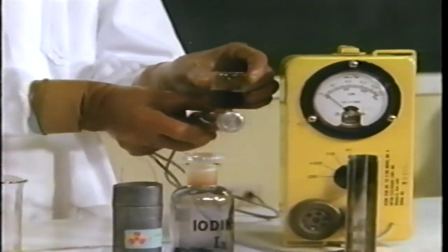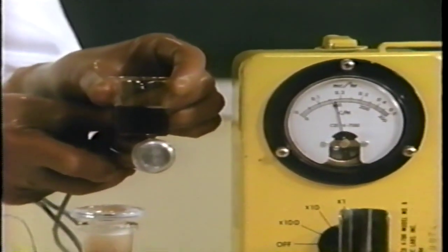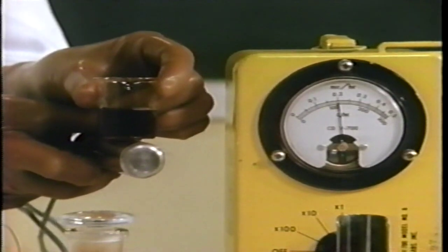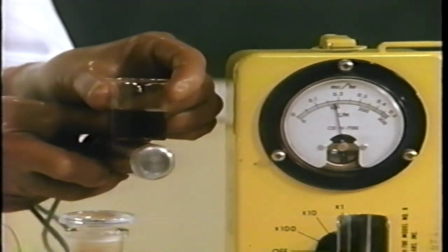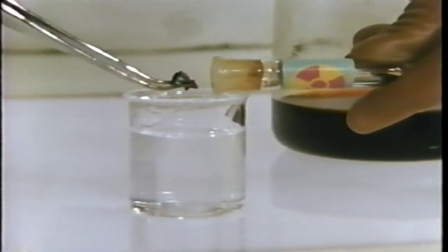Here is the same measurement an hour later. Now the meter shows that much more radioactive iodine is in the solution. The radioactive solid continues to dissolve. Yet, while all this was happening, the color of the solution didn't change. An exactly equal amount of iodine must have returned to the crystal.